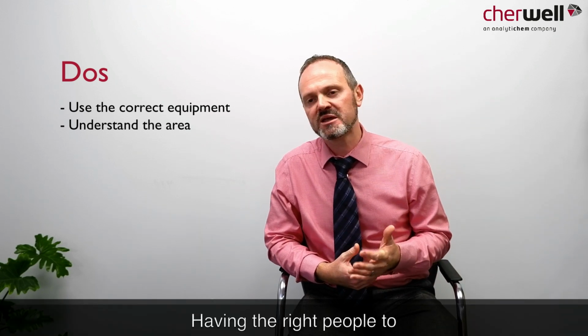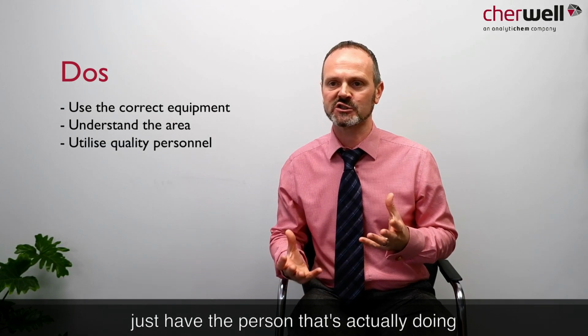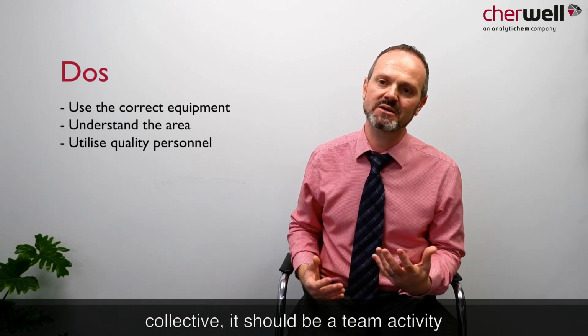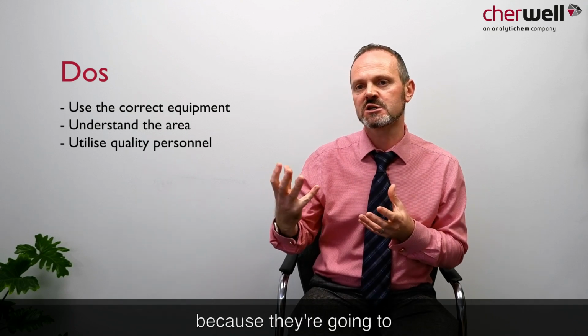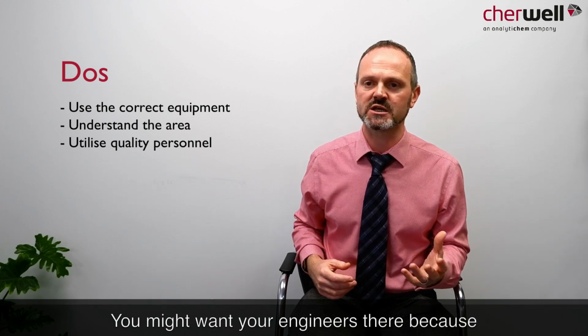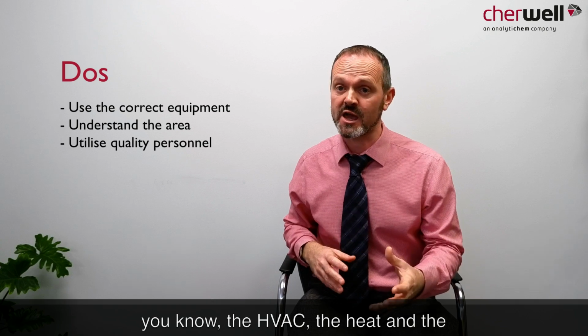Having the right people to support in there. So don't just have the person that's actually doing the smoke testing themselves. It should be a collective, a team activity where quality assurance is involved, and a microbiologist is involved, because they're going to use this information to set up some sort of environmental monitoring routine.